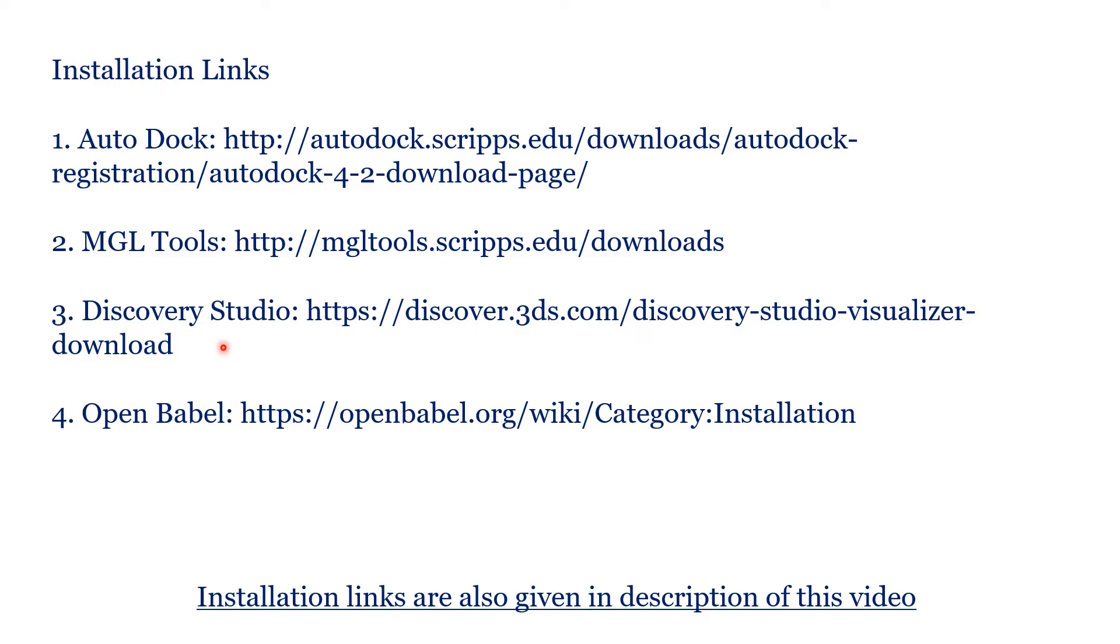And coming to OpenBabel, this is a converter to be frank. Whenever we are trying to download ligands from various websites, we may download it in MDL form, SDF form or mol formats. But our AutoDock can't read all these formats. It can read only PDB format.